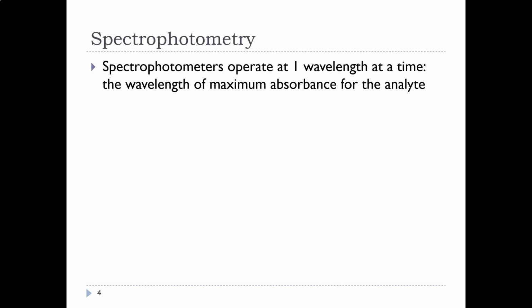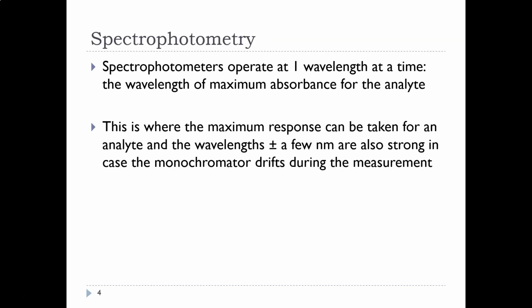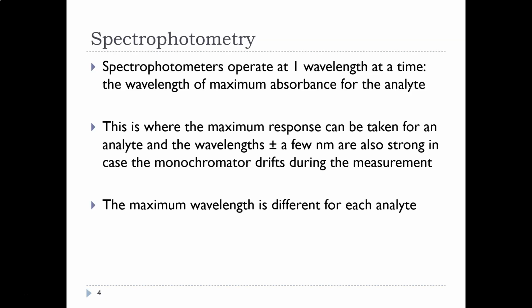Like our ultraviolet instrument usually doesn't get smaller wavelengths than 200 nanometers. So we don't really want to be between 200 and 250 nanometers, because that's where the light bulb is not working as well. Our instruments are not perfect, of course. There's sometimes a plus or minus 1 nanometer range to either side. Like we set the instrument to 510 nanometers, it's more likely to be 509 to 511. It's going to range a little bit between there. So we want it to be consistent right around that, but then drop off noticeably, so it's not measuring as well from there.